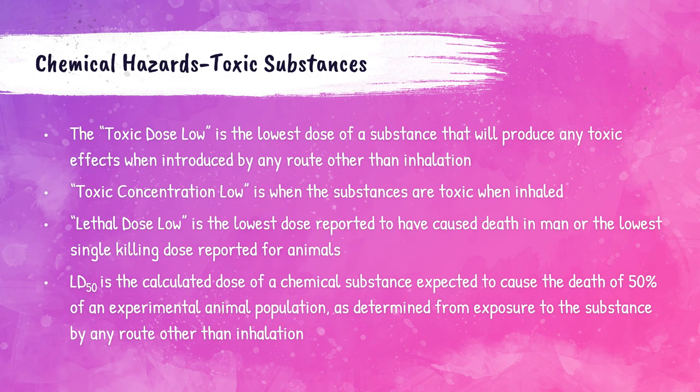There are multiple terms associated with describing toxic substances. Toxic Dose Low refers to the lowest dose of a substance that will produce any toxic effect in human beings when introduced by any route other than inhalation. For inhalation, the equivalent term is Toxic Concentration Low. Lethal Dose Low is the lowest dose reported to cause death in a human or the lowest dose causing death in animals. The LD50 is the calculated dose expected to cause death in 50% of an experimental animal population when exposed by any route other than inhalation.